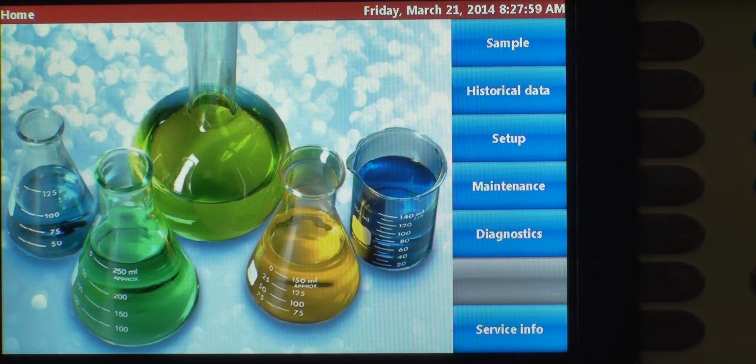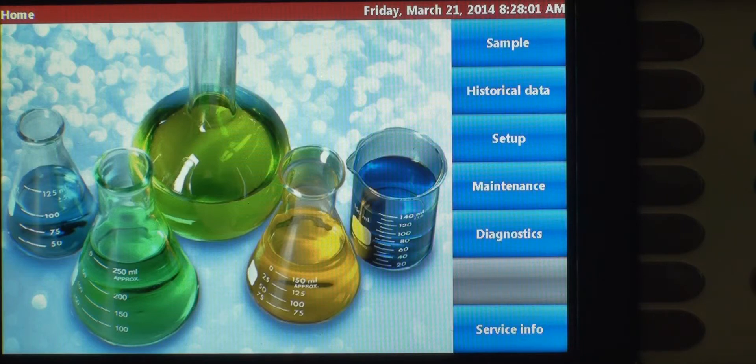The nice thing about the system is that you create a recipe once, and you can use it multiple times, and it drastically cuts down your sampling time.